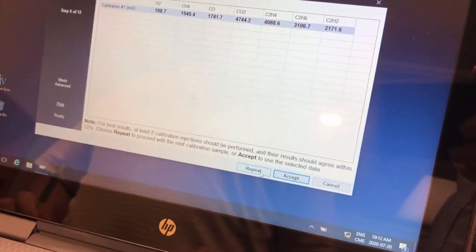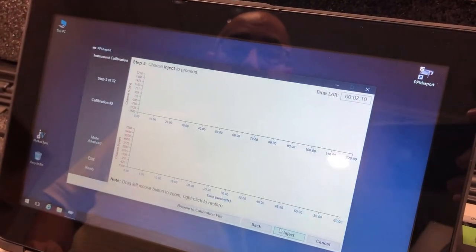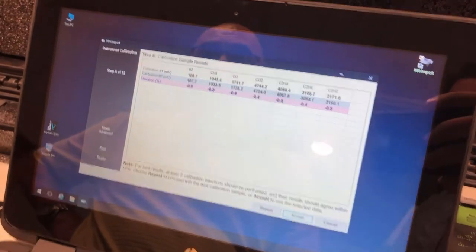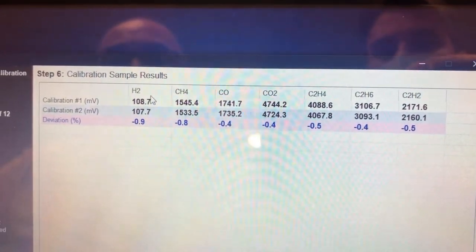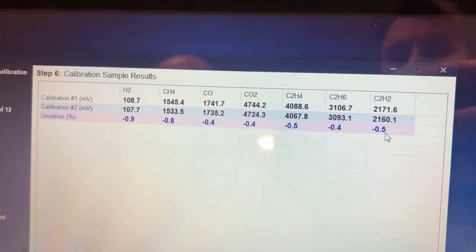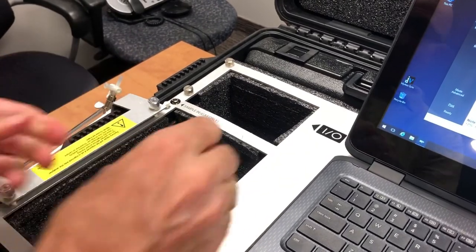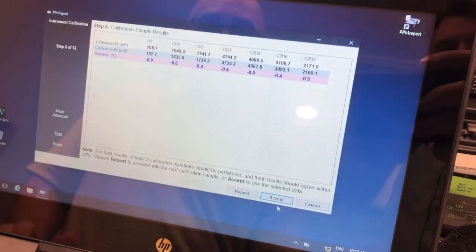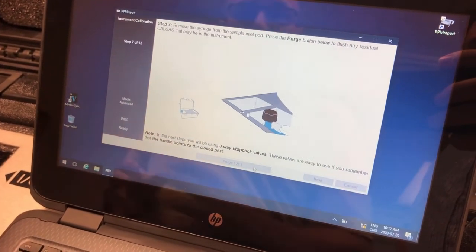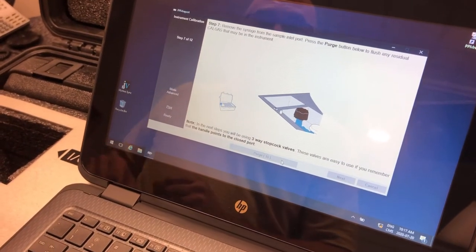Now we do a second calibration. We go back, make sure there is no leak, and inject a second time, wait two minutes, and the system will compare both. Now we have our two calibrations. As you can see, the PPM report compares calibration one with calibration two — all differences are less than plus or minus 2%. That means the Mircos is properly calibrated for the cal gas. You get rid of the cal gas, close the syringe, put it back, and accept it. Then you purge — the purge takes 30 seconds and pushes the calibration gas out of both channels to prepare the Mircos for the next calibration.